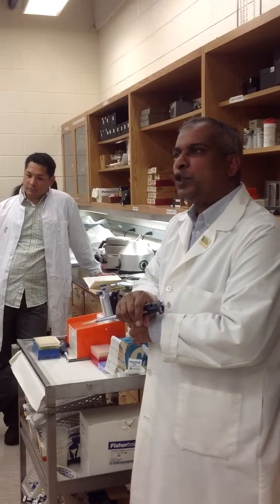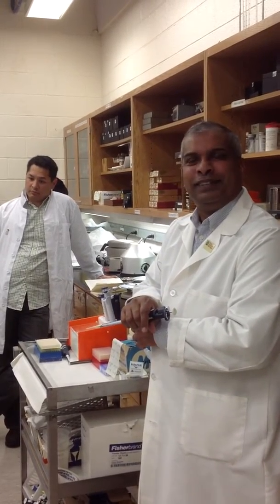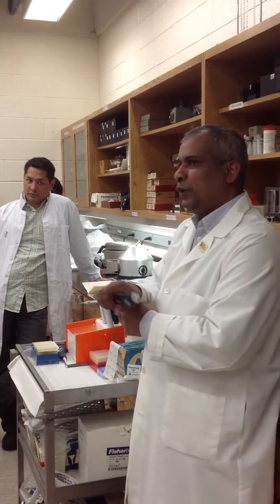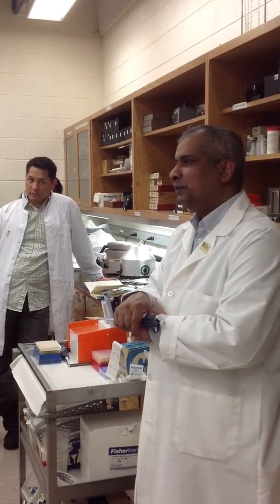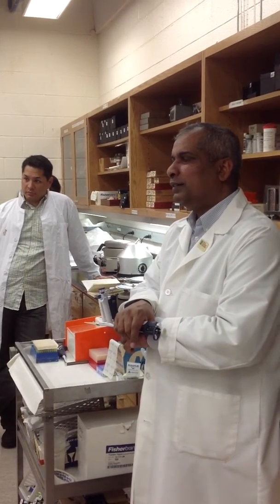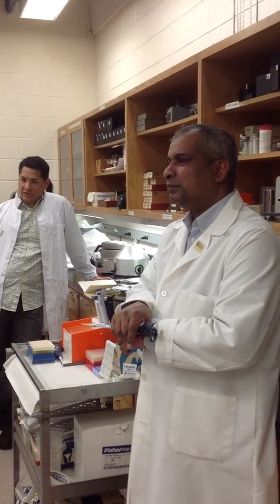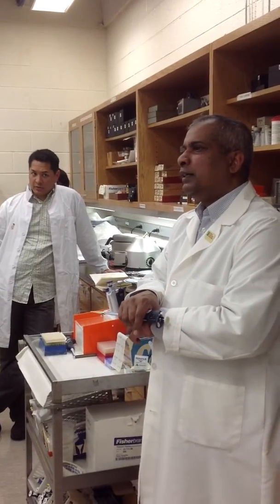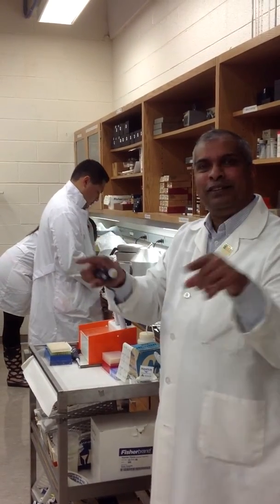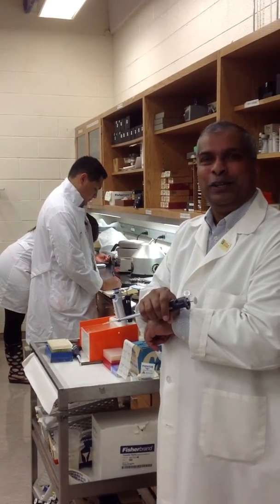So which one square gives you a liter? Not the milliliter, 1 ml we know that. The one before, which is deci. A decimeter cube gives you a liter.